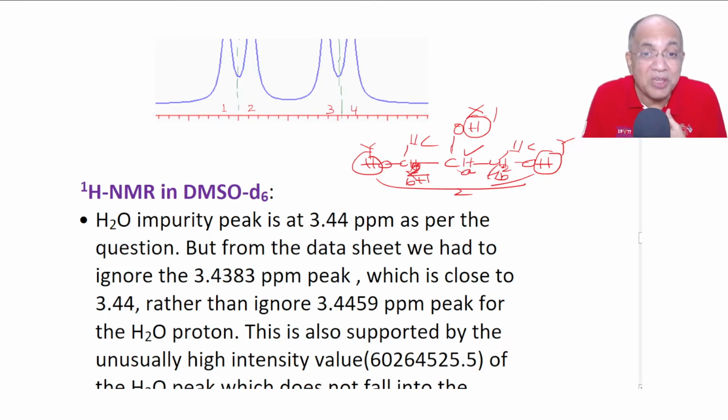But what about the B? B will have a geminal coupling with a larger coupling constant, 10 to 11 like that, and it will be coupling with two neighboring protons accidentally with similar J3 values. So 2 plus 1, 3. So first a doublet by C and then a triplet by these two, so it will be a doublet of triplets. Also in the case of C, these C's are equivalent, these B's are equivalent. So you get undoubtedly a doublet of triplets containing 6 lines.